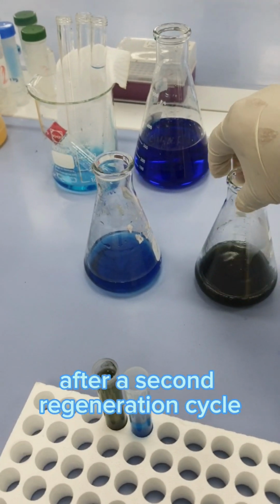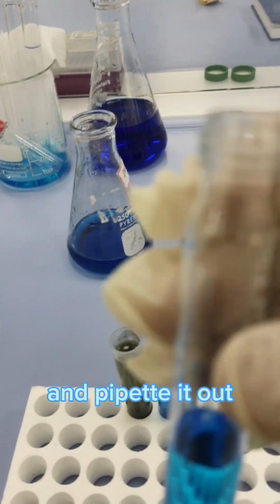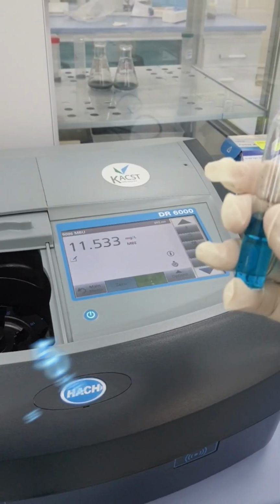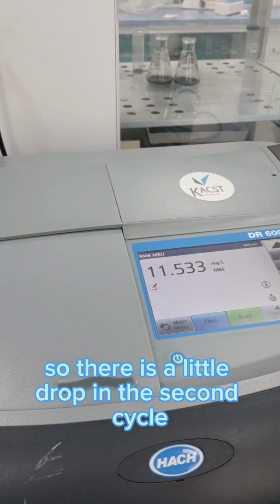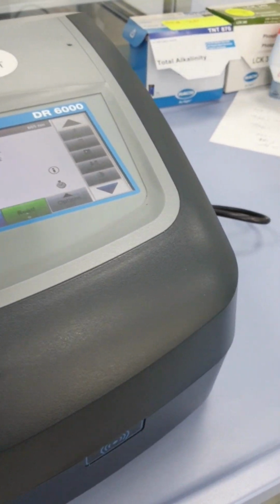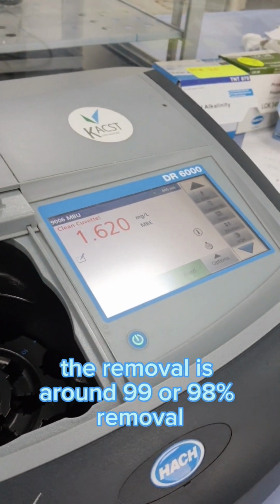After the second regeneration cycle, you can see here, this is the hydrochar, and this is the raw pozzolana. I've already centrifuged the sample and prepared it. You can see there is still around a 45 to 50% removal, and in the first cycle it was more than 50% removal. So there is a little drop in the second cycle. Now in case of hydrochar, the removal is around 98 or 99%.